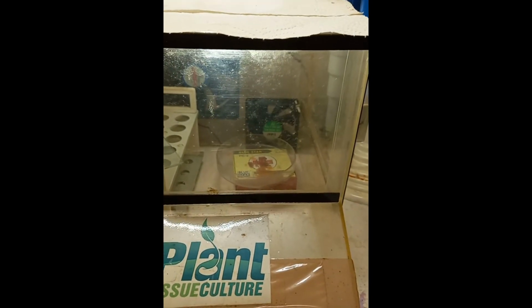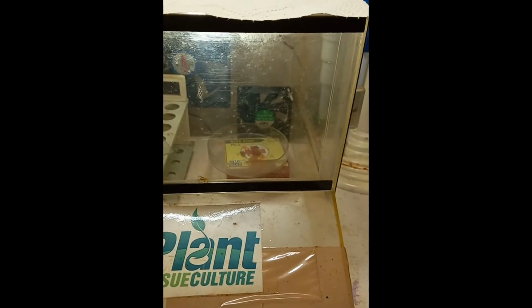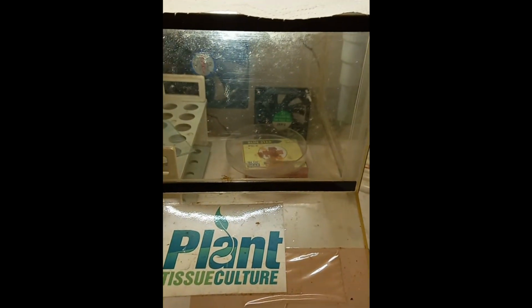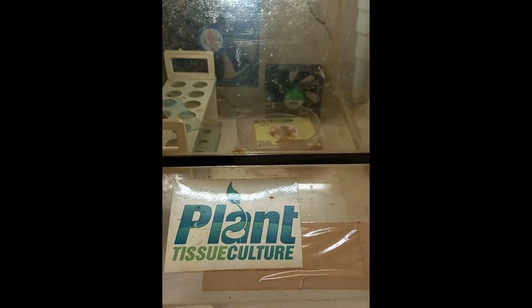This is a dry cabinet. If I switch on the light inside, you will be able to see this is the drying cabinet. You can keep the slides inside to dry. These two have an exhaust filter, an exhaust fan, so you can dry the slides and all those, for staining and all those.